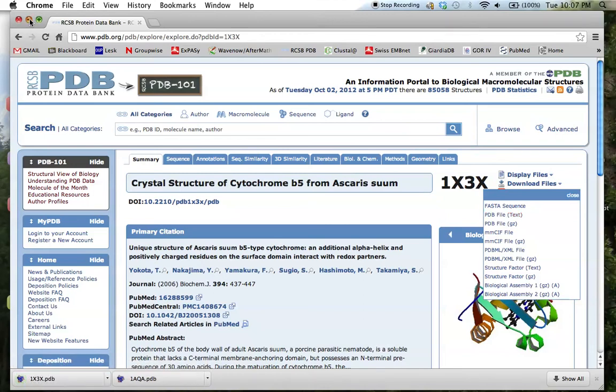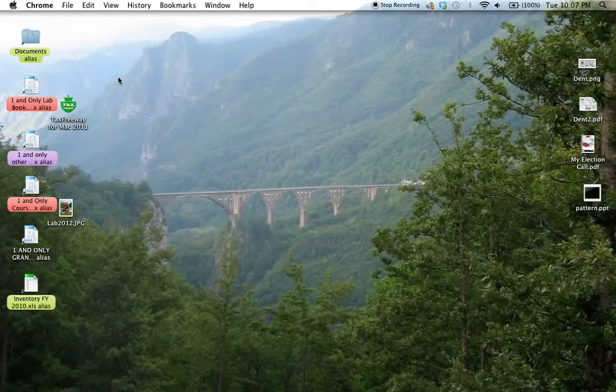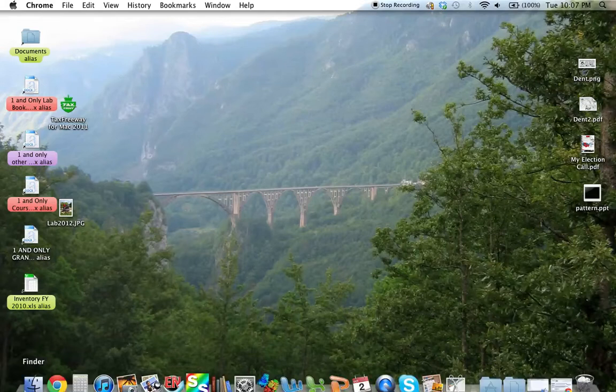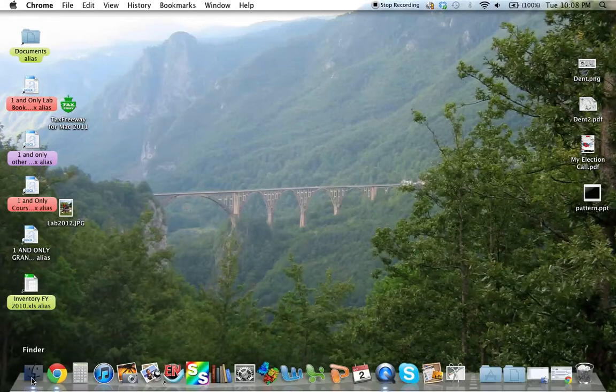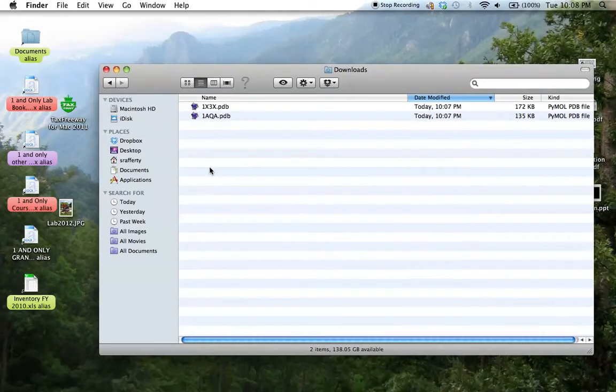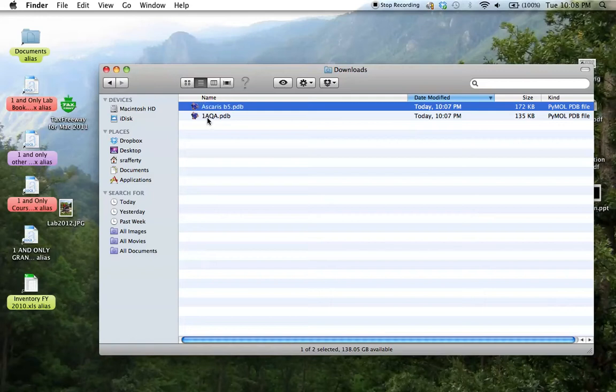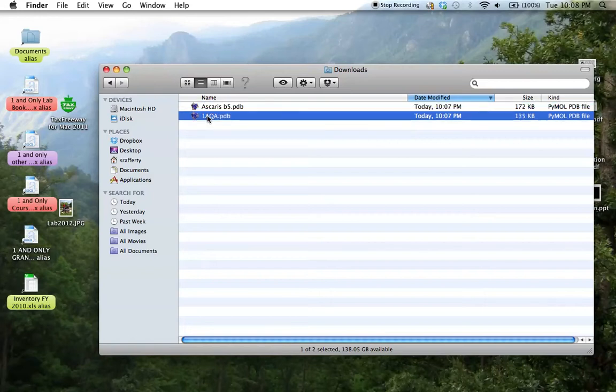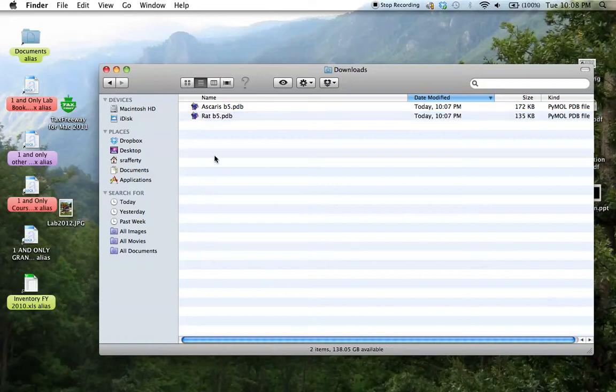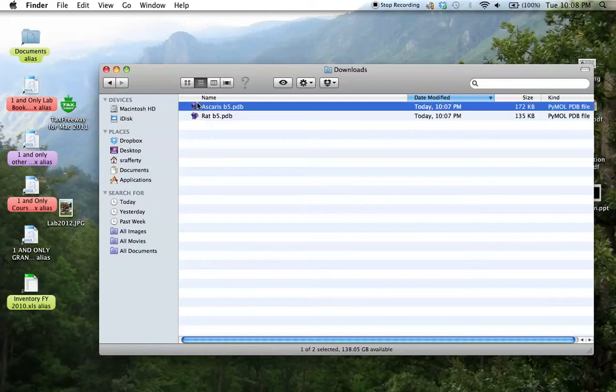And then we close the browser, and you go to wherever your files get downloaded. And just to keep things straight, we'll just rename the files and place them wherever it's convenient.